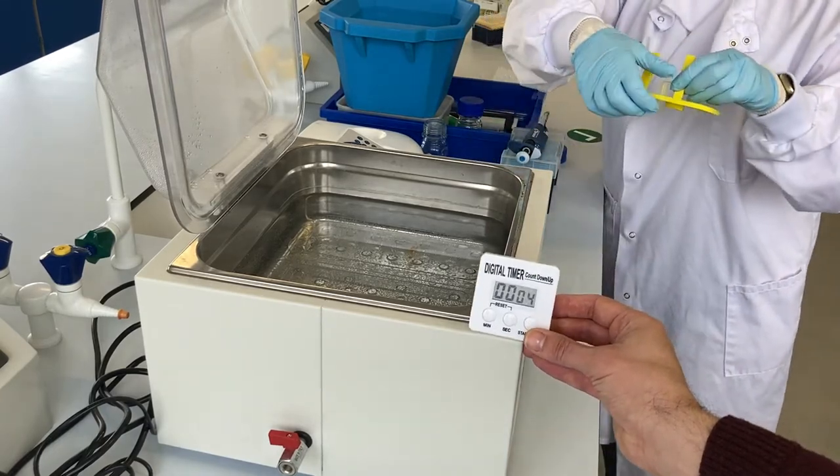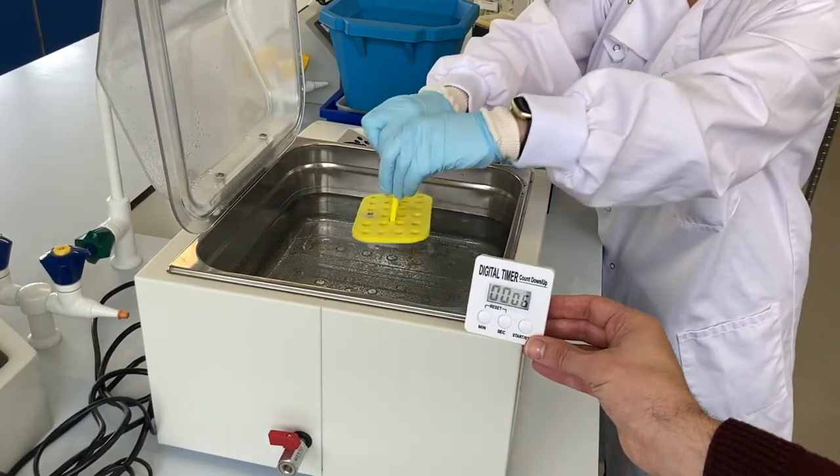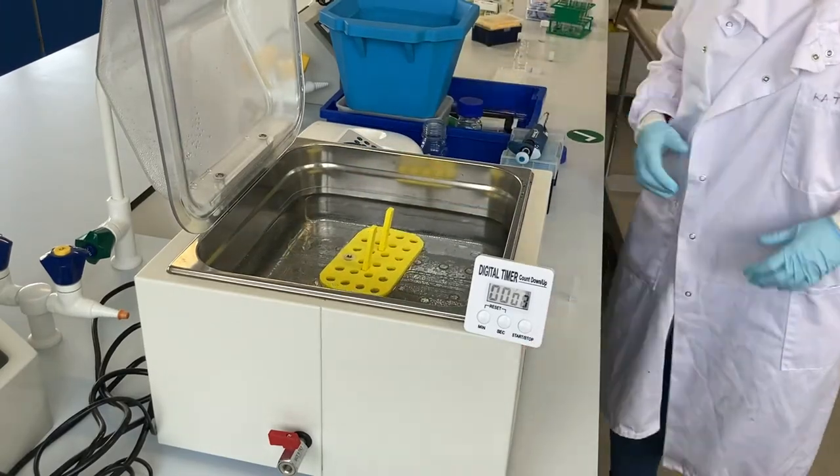These go back into the floaty device, and that's placed back in the water bath for the duration of the experiment.